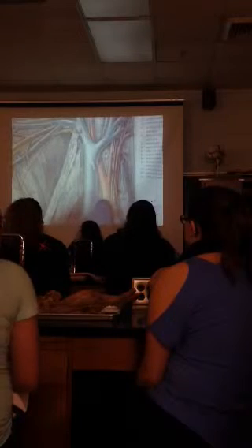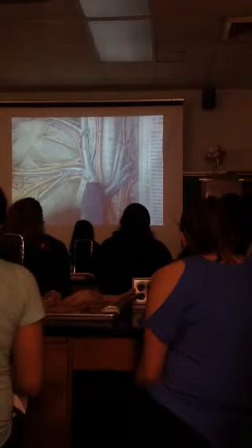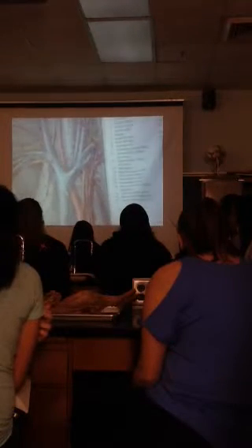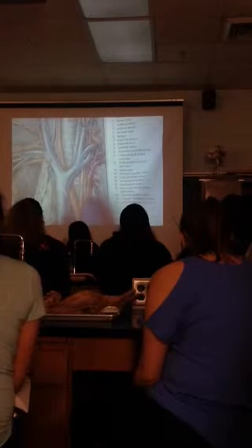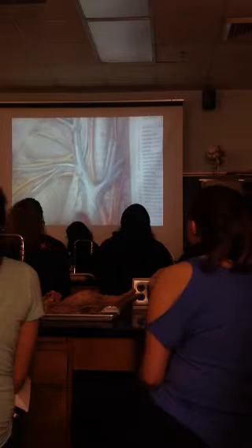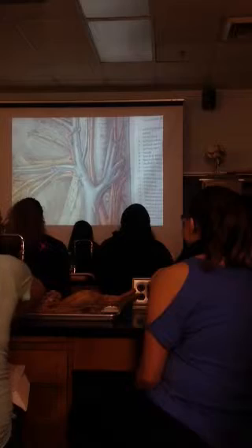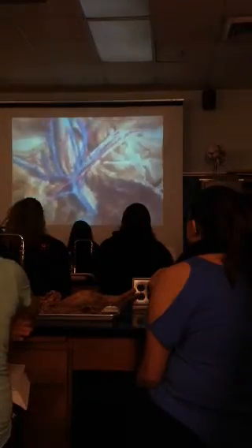Can you repeat that again? Just that last part. Sure. Yep, so brachiocephalic artery splits. You're going to have right common carotid coming up. Right subclavian is under here, we don't really see it. And then that's going to go up into transverse scapular. Left side goes straight up, left common carotid. Over on the side is left subclavian. So on this right subclavian, we should also see the VTC, but not in this one. Or VCTs.